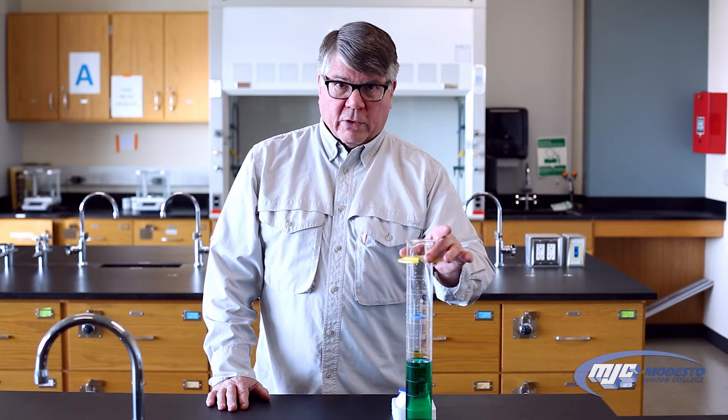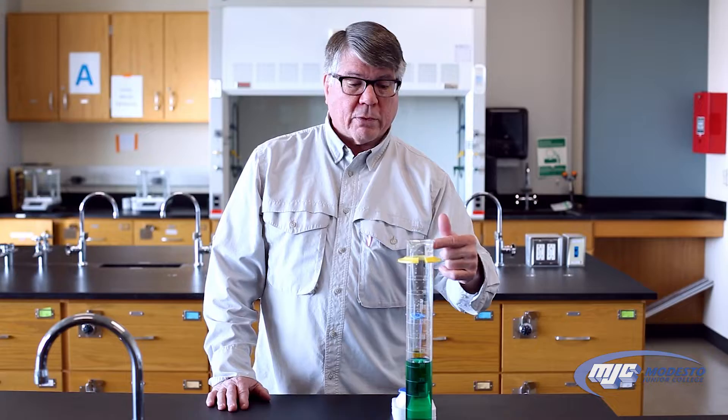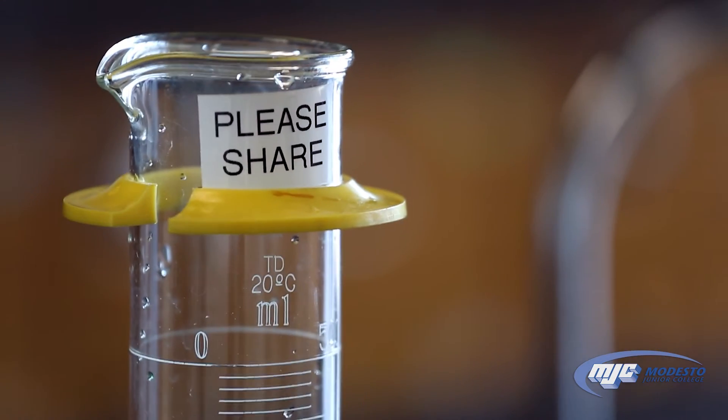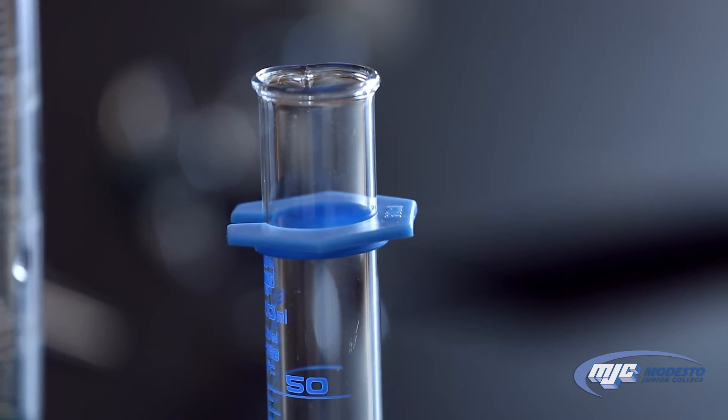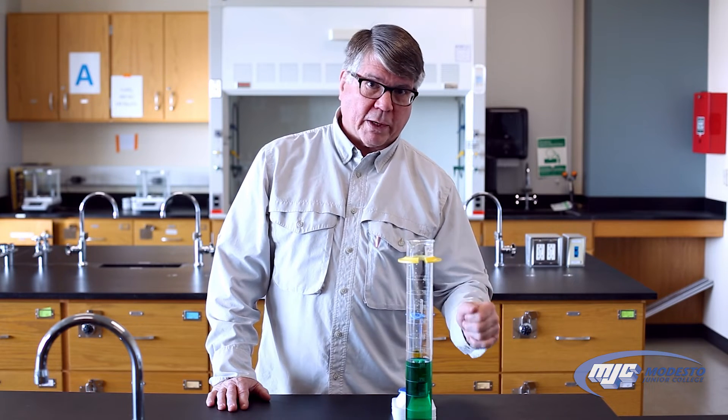You see these plastic rings here — they are not for reading the graduated cylinder, but rather they're to prevent it from breaking if it tips over. If this were to fall over, this ring would hit and prevent the graduated cylinder from breaking, so they should always be up towards the top somewhere.